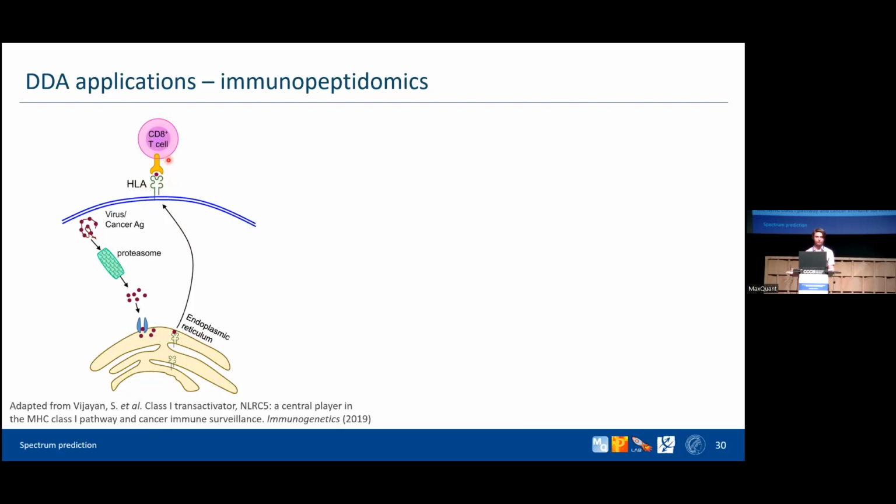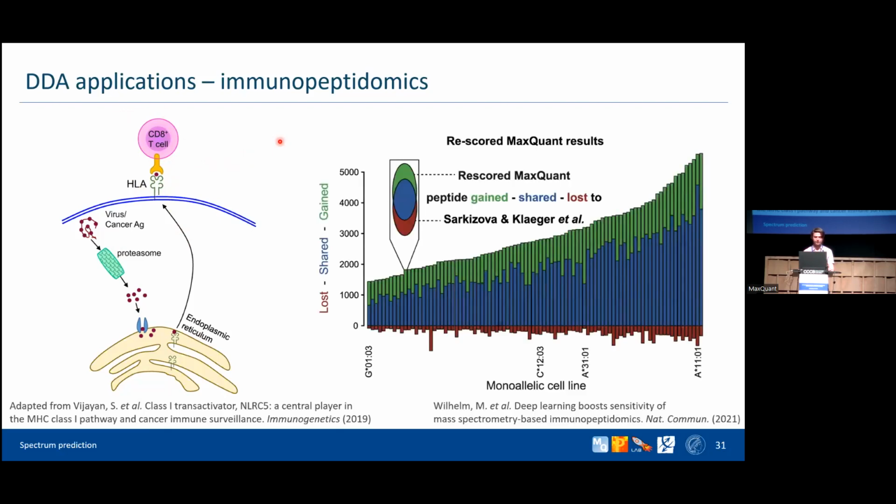They are quite small, so they can be directly measured by mass spectrometry. However, the cleavage is unspecific, so they have no information about terminal amino acids. And so we have the aforementioned larger search space. In addition, the rules of fragmentation for non-tryptic peptides are different. So models have to be trained specifically on non-tryptic peptides. But a trained model can yield really good results.